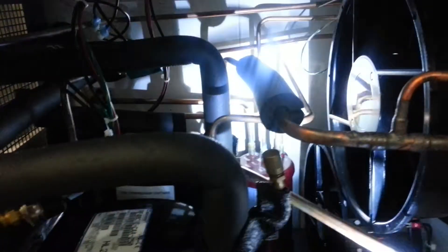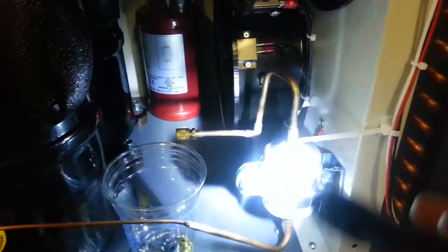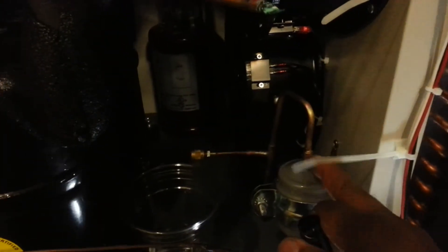Over there is another compressor — we call that the first stage. It's pulling 45-amps lock rotor, so we're going to have to change that compressor. The first stage usually has R134A in it, and that's mostly your liquid phase refrigerant. We've got a filter dryer here.